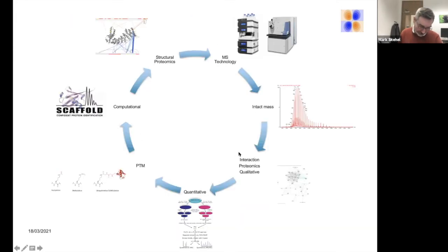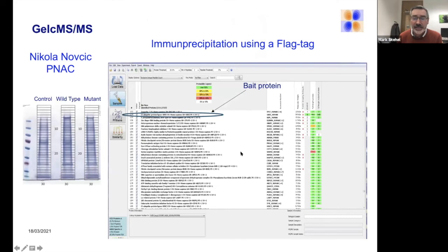The final thing to look at in the last few minutes is the informatics side of things. Now, we are not bioinformaticians or statisticians, but there are a number of tools that we try and use to help us with that. And I know at the LMB, everybody likes to do their own data analysis. So, you know, we do a certain amount, as much as you want. We prefer not to give raw files out because I think that there lies danger, but you know, that's not unheard of either. So one of the tools we use is Scaffold, and that's primarily looking for interacting proteins.